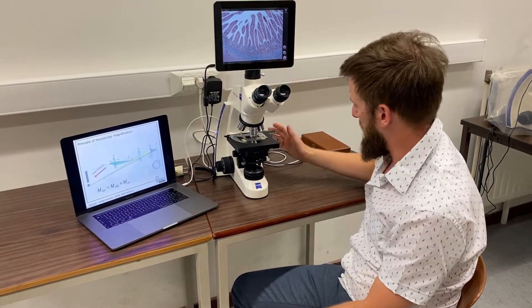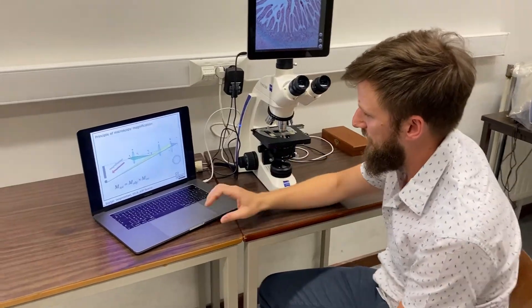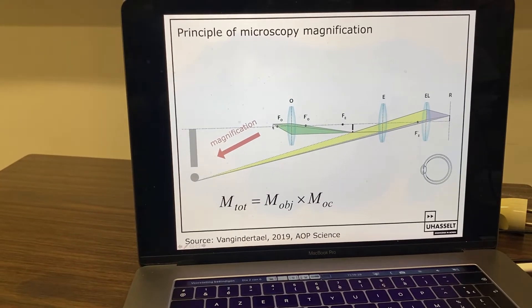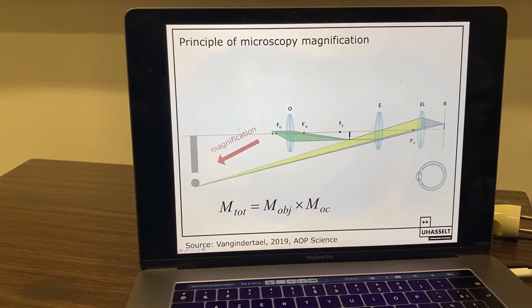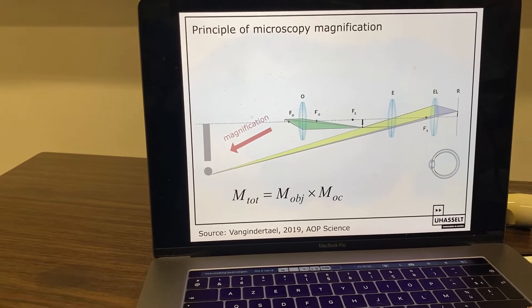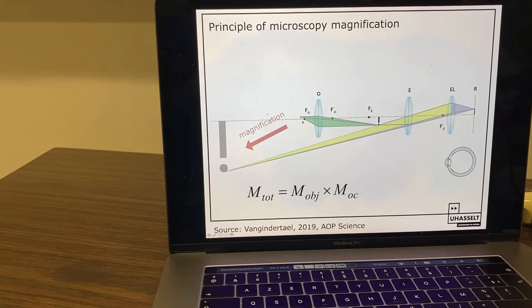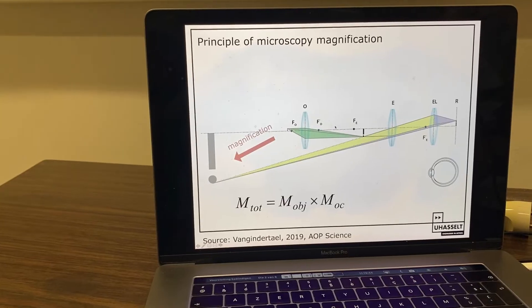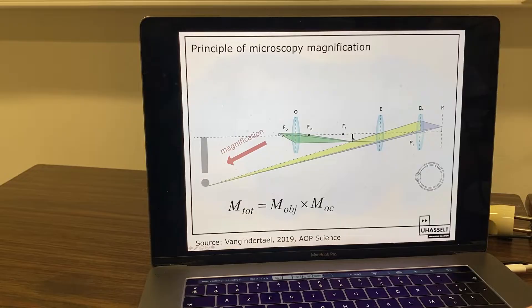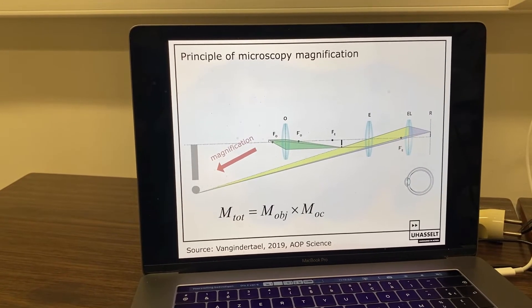Besides the illumination part on the bottom of this microscope, there's also the image formation part, which I will explain using this simple scheme. In this scheme, the sample is positioned a bit further than the focal length of the objective lens, depicted by O here. This objective lens creates a real image — an image in real space — to the right side of this lens, magnified according to the magnification specified on the objective lens.